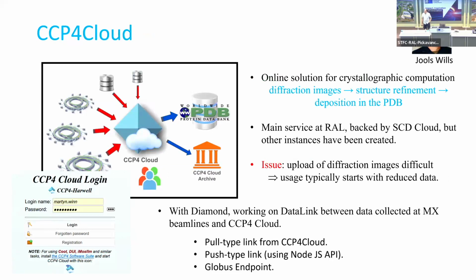So for CCP4, one thing to highlight is CCP4 Cloud. This is a cloud-based service, which is mainly run here, backed by STFC Cloud. And users can log in, have access to most of the CCP4 suite, upload their data, and do all of the structure solution in the cloud. That's been running for a few years and is getting increasingly popular.